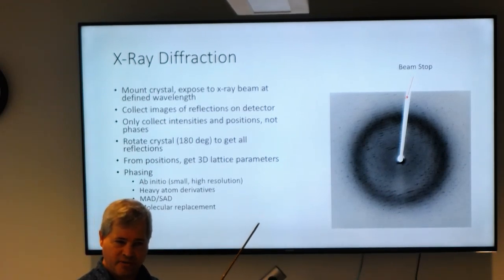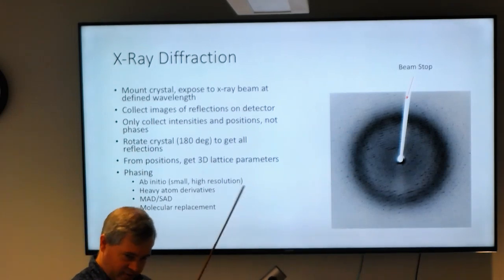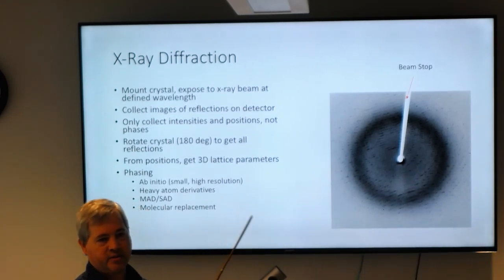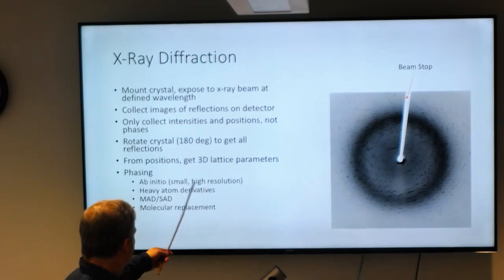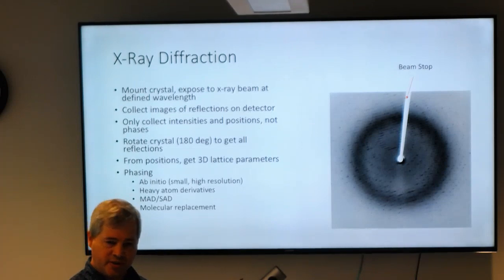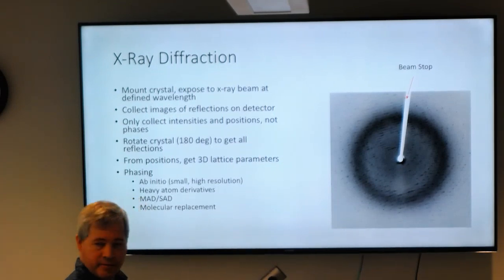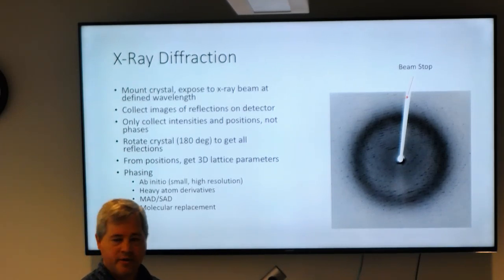It starts with some sort of initial guess, figures out what the diffraction intensity should be, and then converges on the right answer. But it's quite a complicated problem, so it only works for smaller molecules. You can't do it for something like a 30 kilodalton protein, I don't think. I'm not sure what the maximum is, but it's probably around a few kilodaltons. So it's for these small organic crystals, these small examples. For something small, it's good enough. It works well.